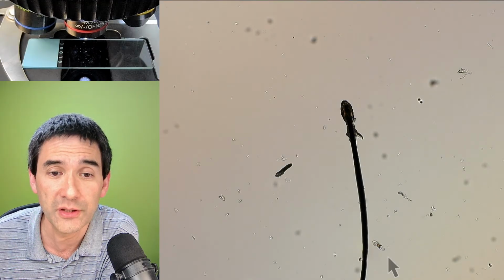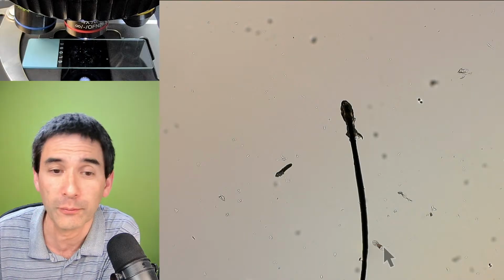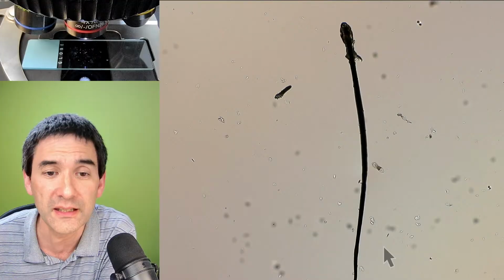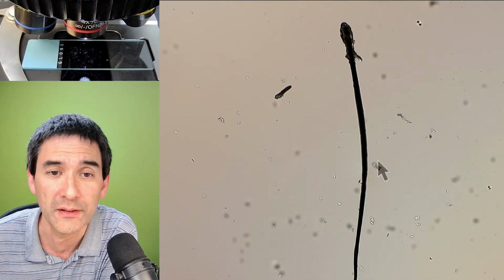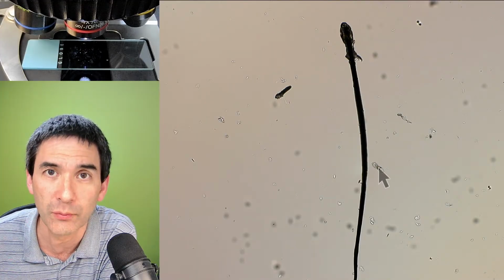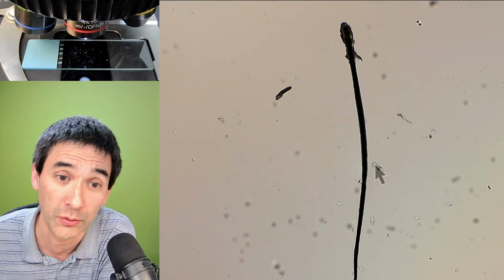And this one down here, that's the dead face mite from before. Let's move it up a little bit. Yeah, you see, it's interesting. The dead one is more transparent. It used to be darker. It was alive before. For whatever reason, it died, and then it became somewhat more transparent over the course of an hour or so, right?